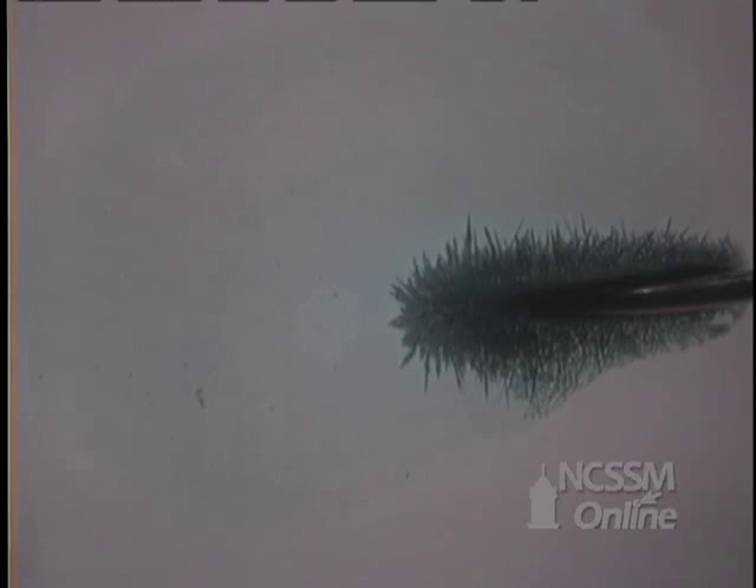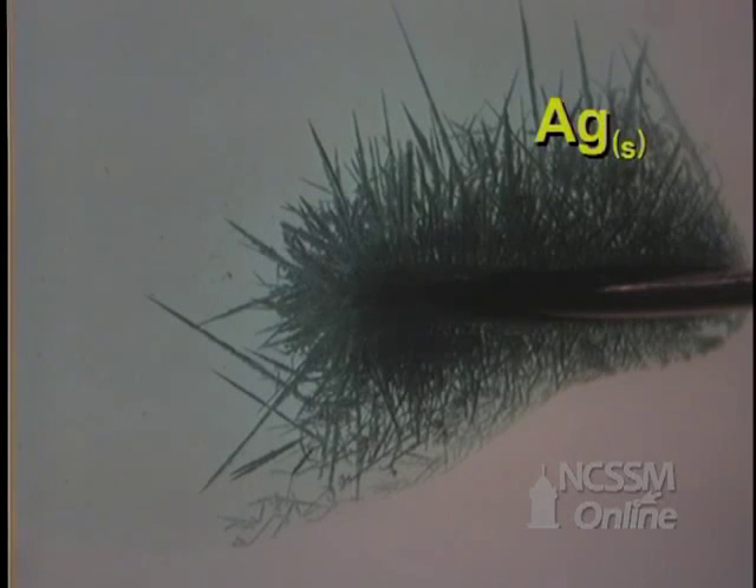A drop of one molar silver nitrate is placed on a microscope slide. A thin copper wire is touched to the solution. You can see the rapid formation of shiny needle-like crystals of silver metal. Notice that the solution turns pale blue due to the formation of copper nitrate.